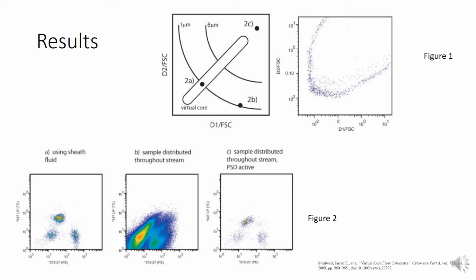Additionally, the PSD can be refined through using different shapes of the pinhole for the aperture rather than the rectangular aperture. Altering this pinhole shape will change the amount of light sent to the orthogonal detectors, leading to different amounts of detection. Another evaluation was done in which its ability to perform immunophenotyping and measure phytoplankton was tested.